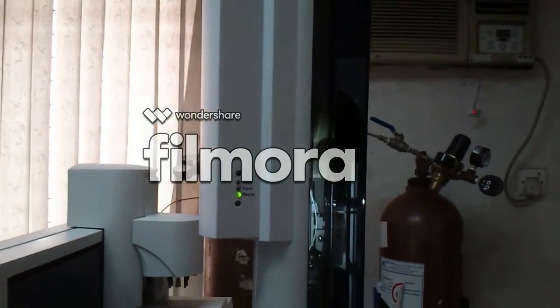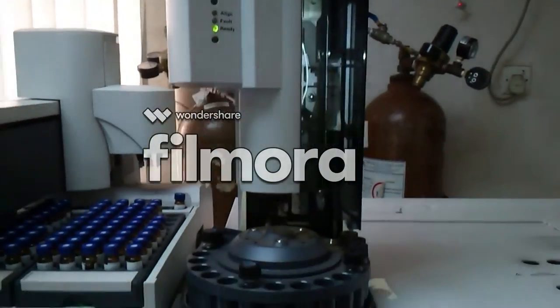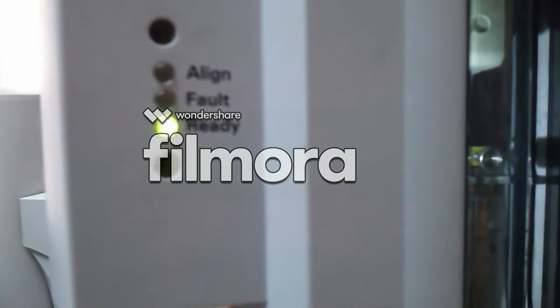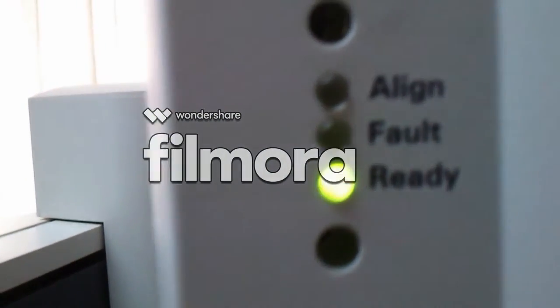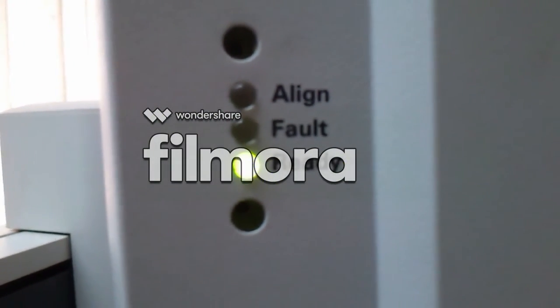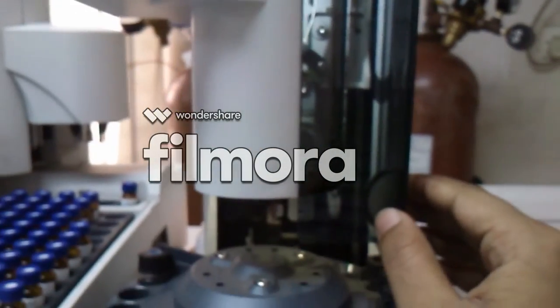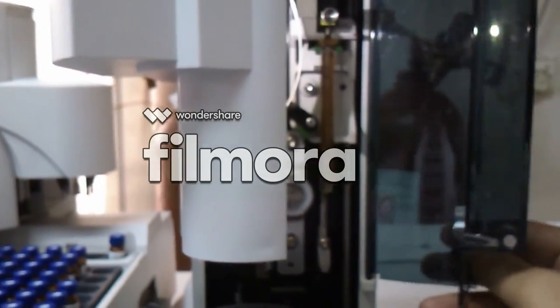This is the injection tower of LG CMS. These are the indication lights of the tower, which indicate the current situation of the injector. The upper hole can be used to align the injection tower, but it is not recommended.